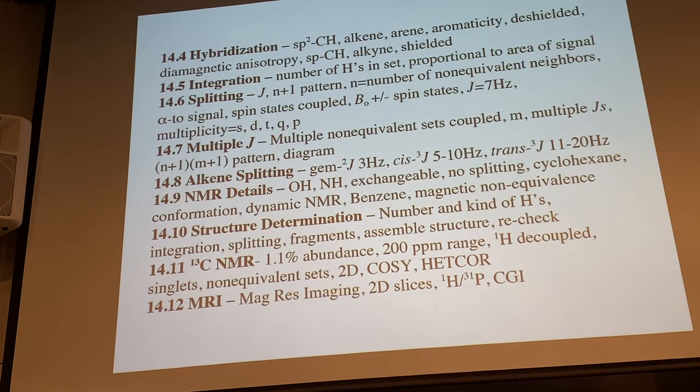We will look at C13 NMR. It's also a very useful technique. It has a wider shift range. The C13 atom, though, is not very abundant, 1.1% abundance. C12 is the major one, but that's spin 0, okay? The physics of the even number of protons and neutrons makes it such that the nuclear spin is silent in the NMR. It has to be an odd number of protons and neutrons, which is great for us. Protons are spin 1/2, as well as C13 is spin 1/2.